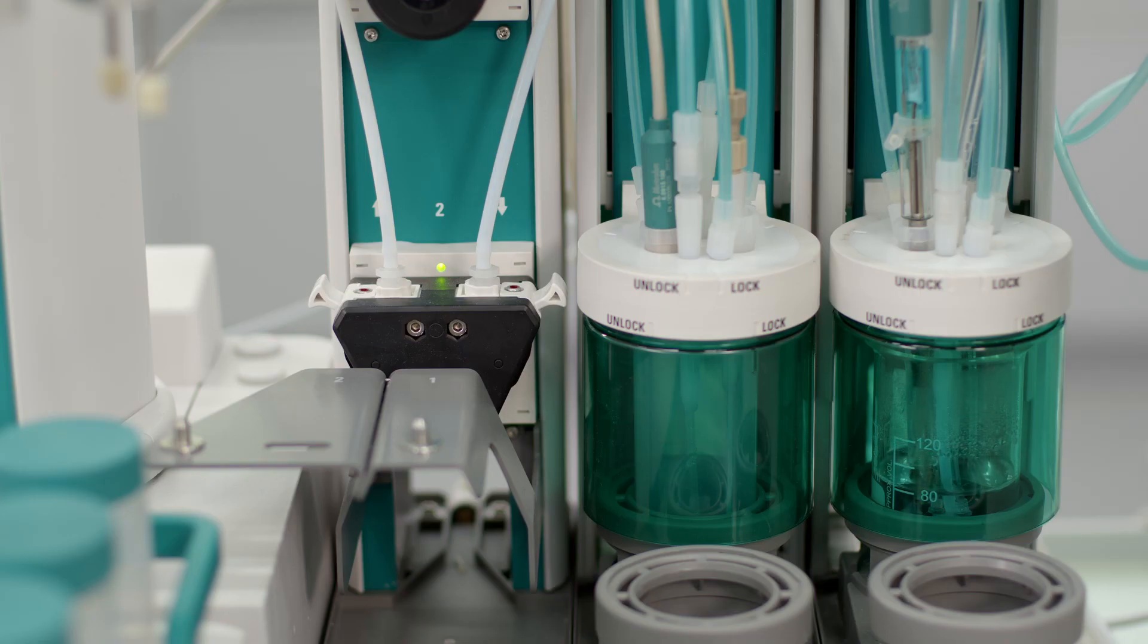Finally, all tubing, capillaries and sample beakers are automatically cleaned.